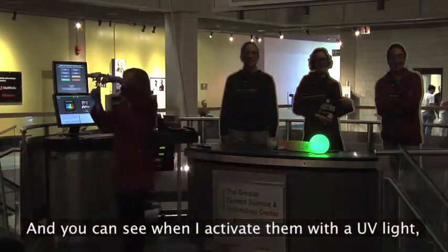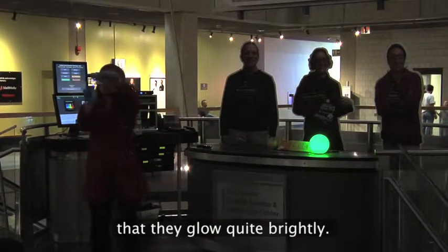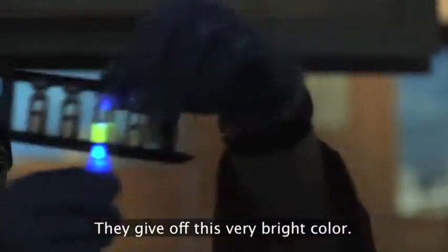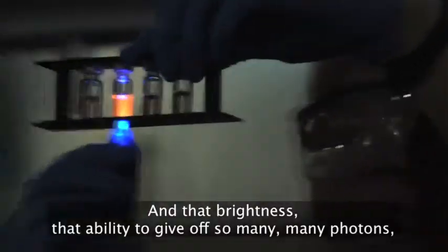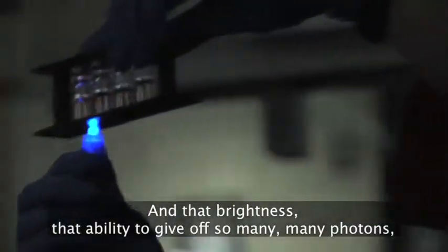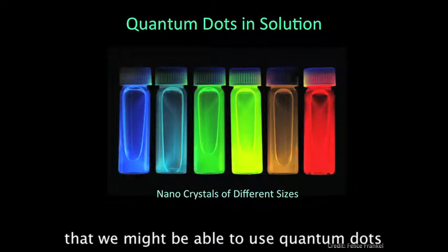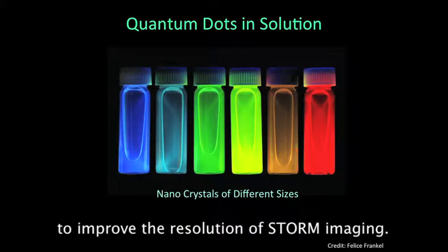And you can see when I activate them with a UV light that they glow quite brightly. They give off this very bright color. And that brightness, that ability to give off so many photons, is why Jessica and her team think that we might be able to use quantum dots to improve the resolution of STORM imaging.